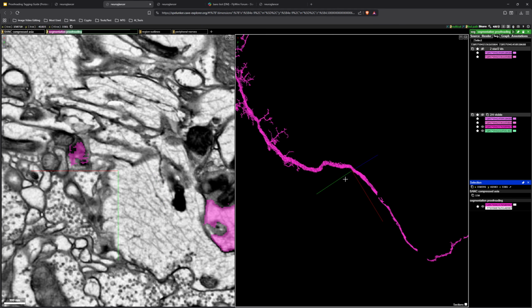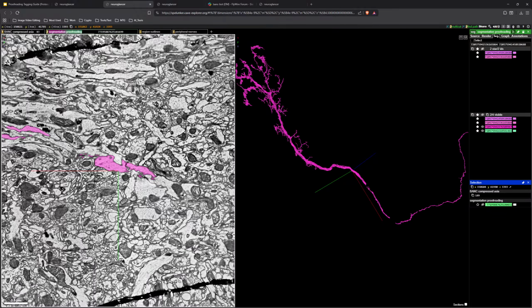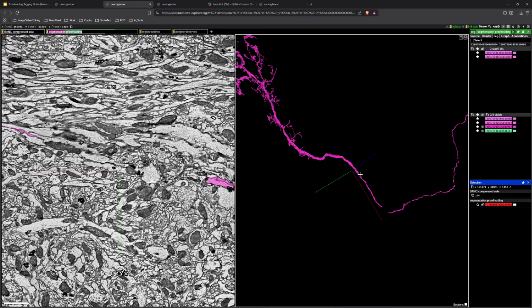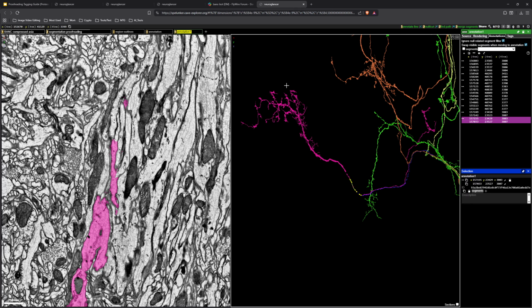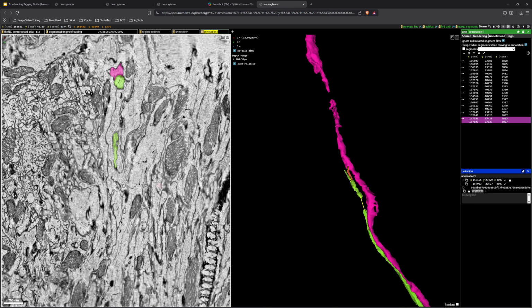So let me just scroll through. Then I saw, okay, this is what this person was dealing with. I can understand why it'd be very hard to find the soma tract like this. Obviously, here's a break, right? So I checked the breaks, everything looks good. And if we go back over to here, you could see, I did find the path and it did split off right where it starts to get thinner.